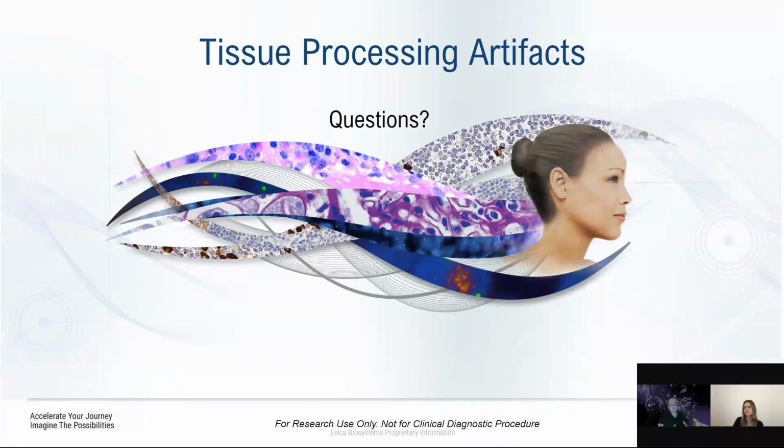But for research, if you're not processing every day, if you're not changing out those bottles every week, you may be changing them so often it may not apply. But there are facilities that maybe only process once a month. And so then you do want to follow those regulatory requirements when it comes to labeling or to putting on not only your NFPA sticker, but also that expiration date. That would certainly be unique to every facility and the requirements that they have in place to the laboratory.